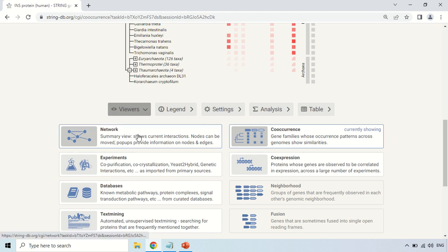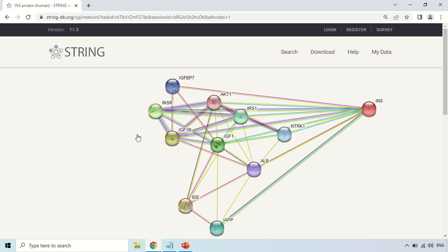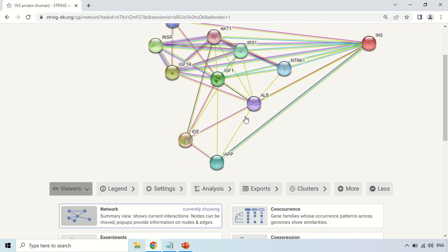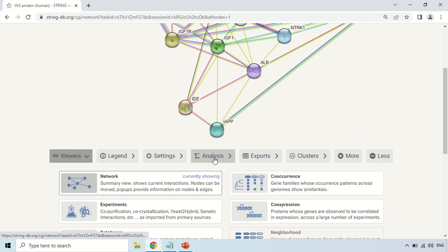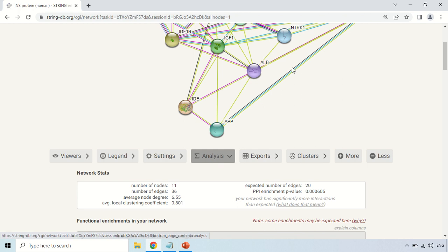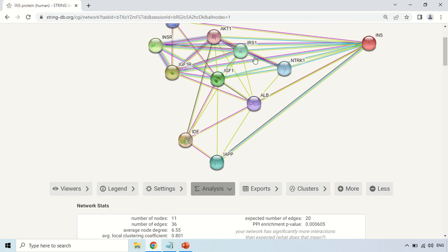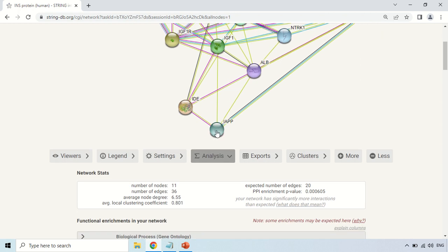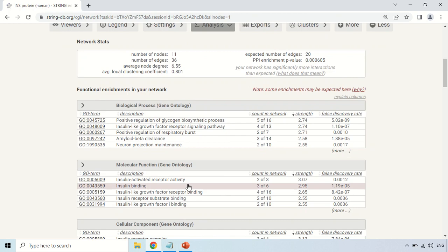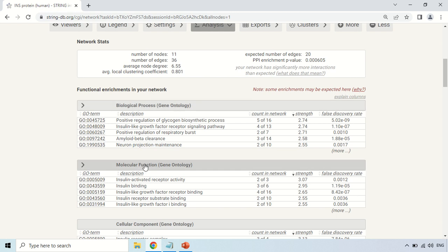This covers the Viewers section — how you can change the layout of this interaction diagram. I am clicking back on network, so it will move back to the network form. The next column is the Analysis tab. Here it shows the analytical parameters of this network. There are 11 nodes, and it shows all the functions of these proteins, including biological functions, molecular functions, and so on.